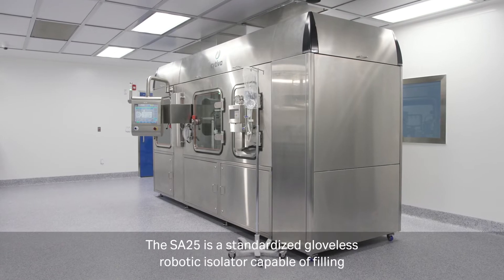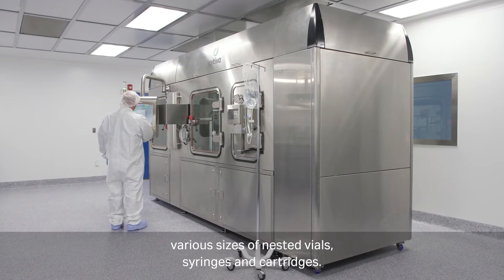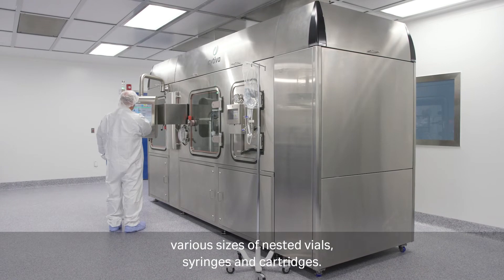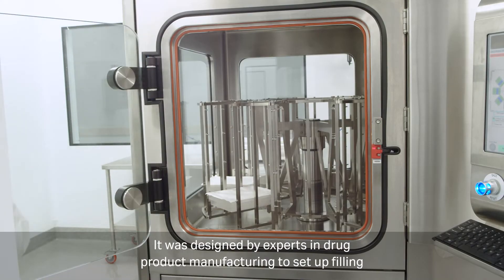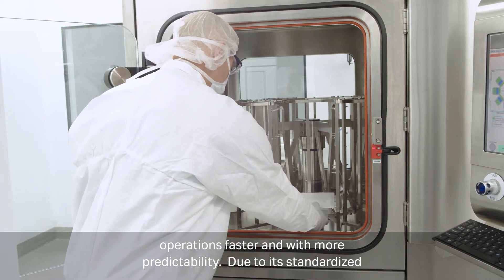The SA25 is a standardized gloveless robotic isolator capable of filling various sizes of nested vials, syringes and cartridges. It was designed by experts in drug product manufacturing to set up filling operations faster and with more predictability.